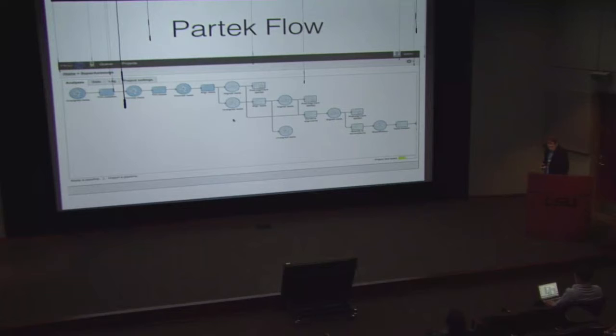After running Partek, the next step, like I said, is to take a look at the gene expression. After we determine the gene expression between wild type and mutant, I'll pass the data along to other members of the group, and they'll continue to look specifically for genes that are expressed and keep going in this experiment, and we'll hopefully get publications.